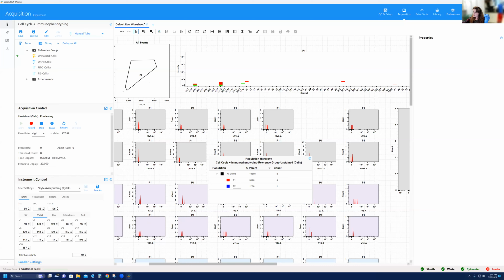And we don't have to touch the blue and the yellow-green, or the red, because those dyes that we see, FITC and PE, aren't as excited by the UV and violet, and that's not our primary detector. So we want to make sure that we get the best resolution and only bring down when necessary for laser lines. I hope that answers the question sufficiently.